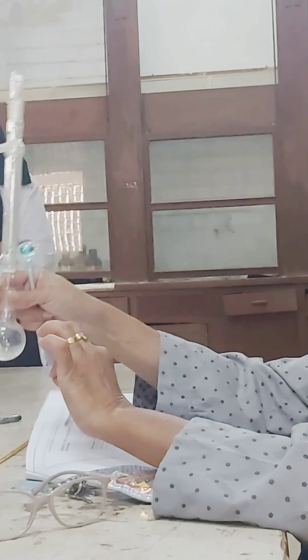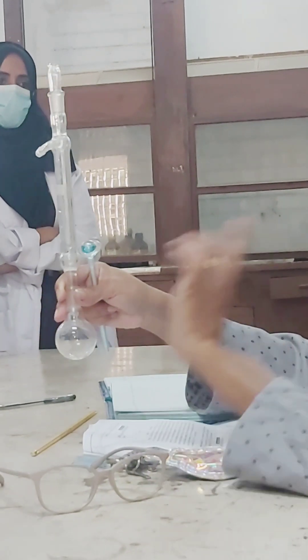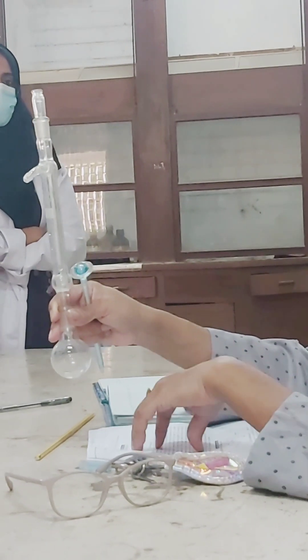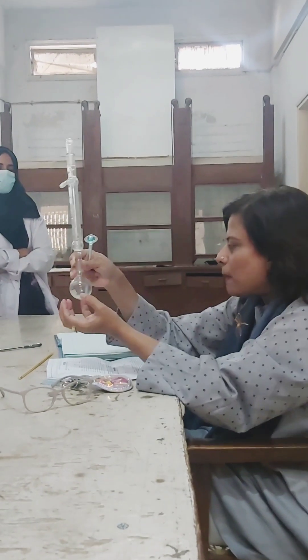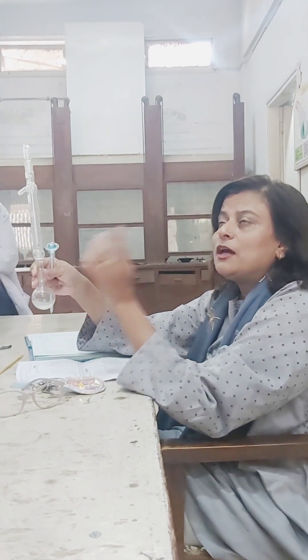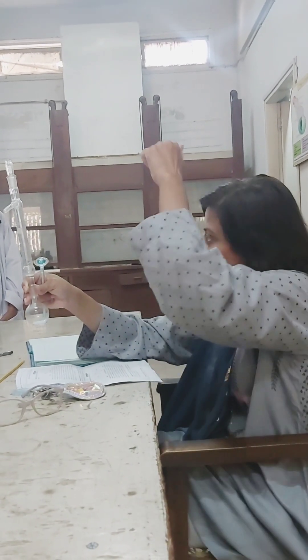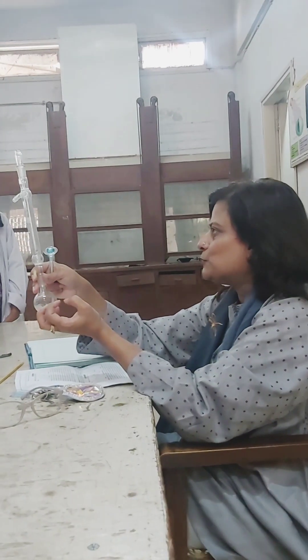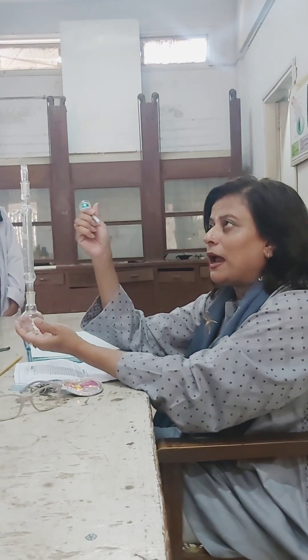You do not start recording the heating time the moment you switch on the heat and set up the apparatus. The time stated on your scheme for how long to reflux starts only when the first drop falls back into the reaction mixture. That is when refluxing has begun.